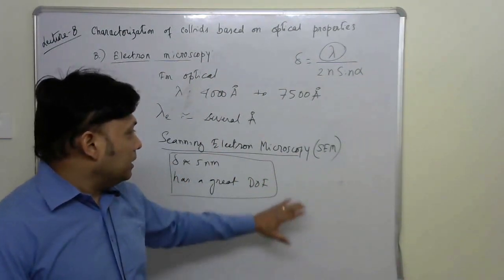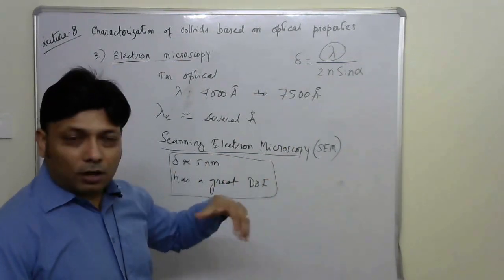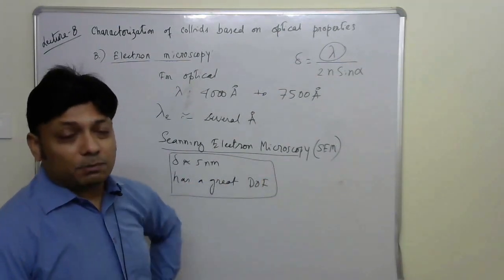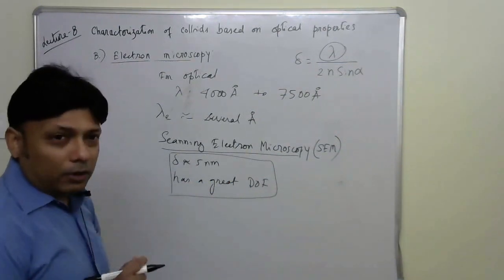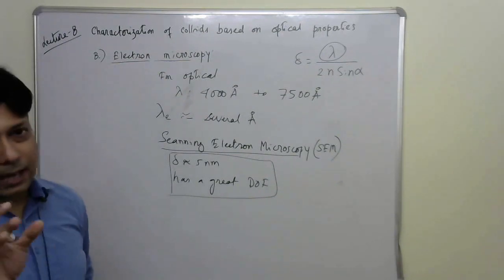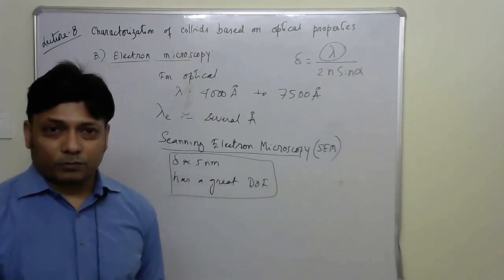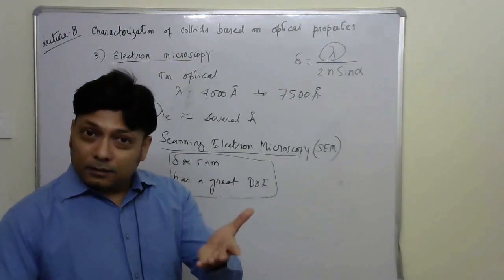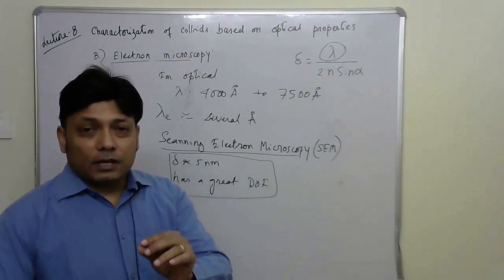Therefore, this electron microscopy technique is not good to capture how colloidal particles behave as is when they are in a suspension medium. For that, we need another kind of microscopy, and that microscopic technique is called ultramicroscopy. As I remember, I mentioned it during the discussion of particle electrophoresis, that the movement of those particles during electrophoresis is observed by microscope.